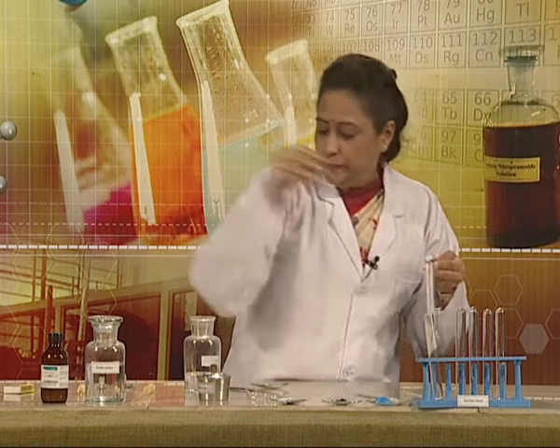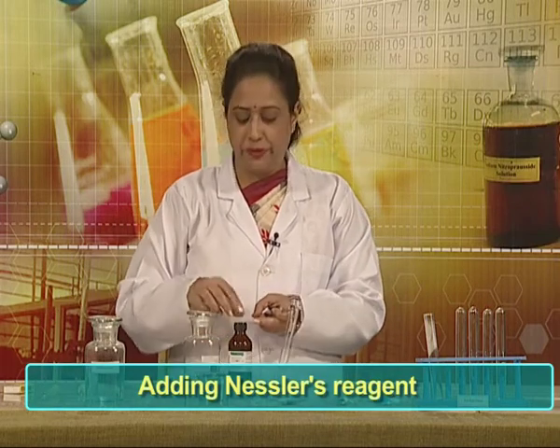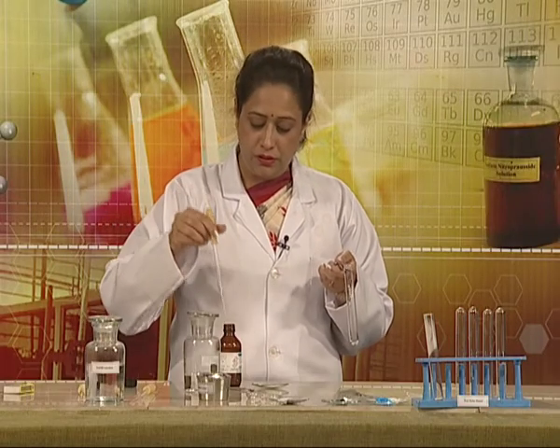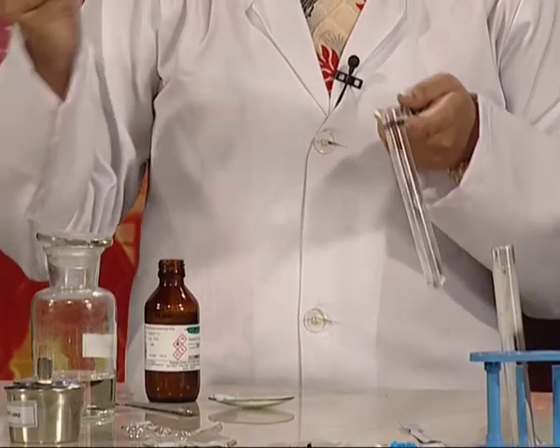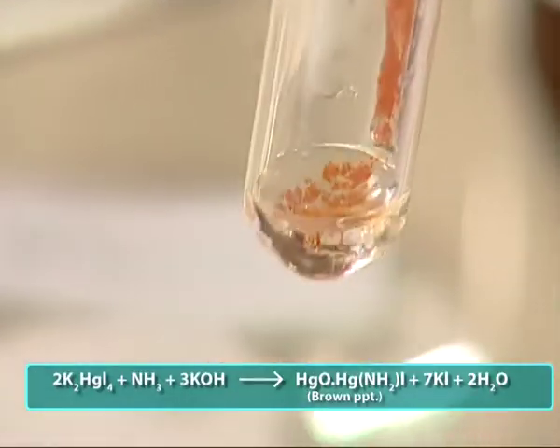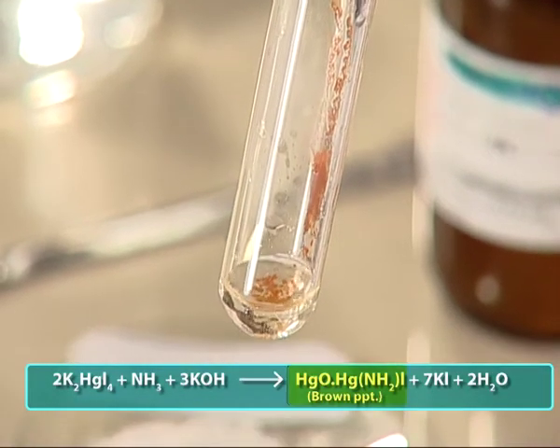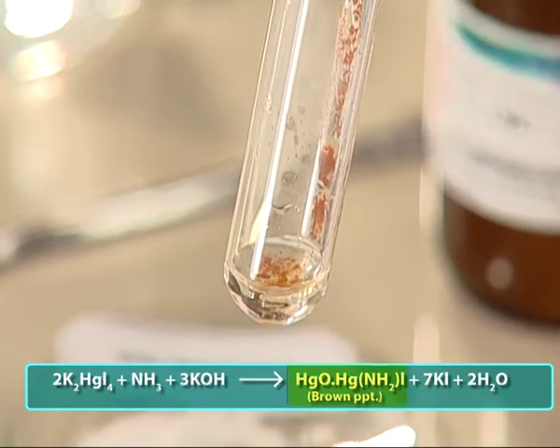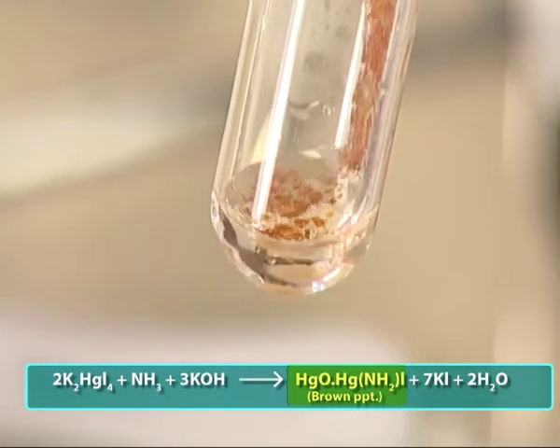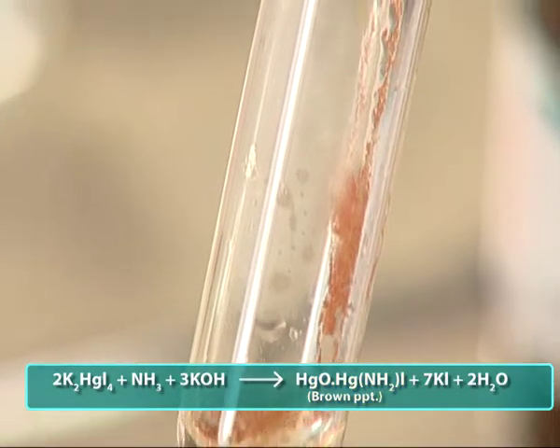In the same test tube, we can add Nessler's reagent to perform the other confirmatory test. Nessler's reagent has the formula K₂HgI₄. When we pour 1 to 2 drops of Nessler's reagent, we see the formation of a brown precipitate or coloration, which is due to the formation of a complex commonly known as Millon's base — the basic mercury amido iodine complex.